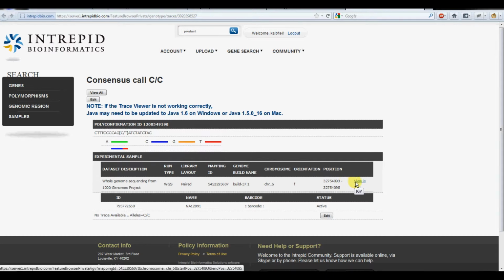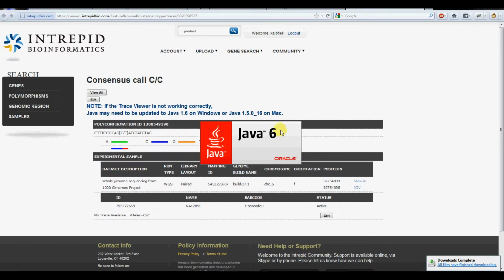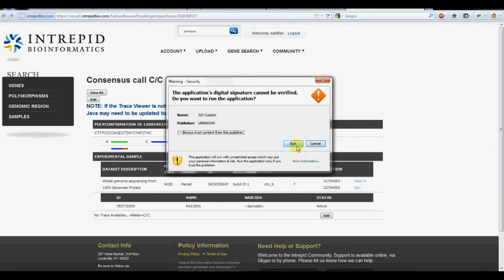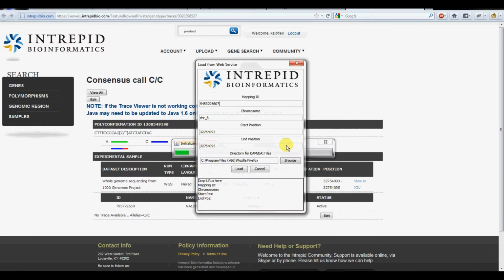That feels good and makes for a more compelling story. But if we want to go and investigate this in greater detail to see perhaps why the genotyping assay might have been compromised, we can do that. By clicking on View in IGV, we get the Integrated Genome Viewer, which was developed at the Broad and the Whitehead, and we have modified it such that it will pull data securely out of our data management system.